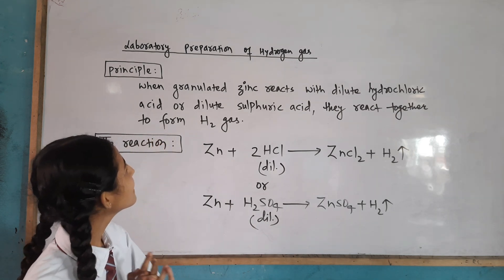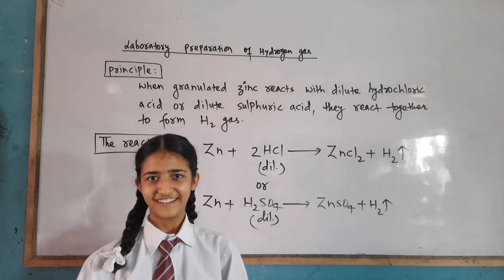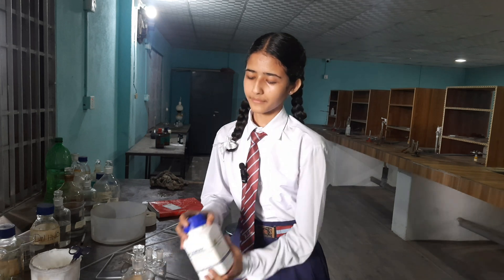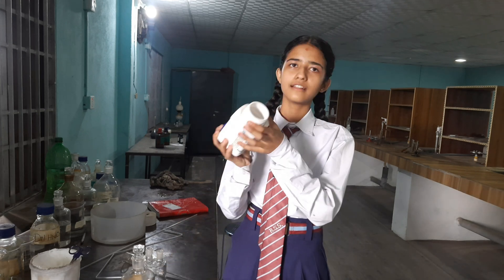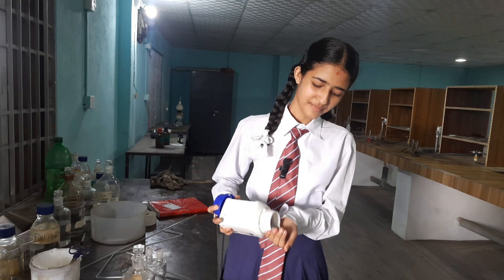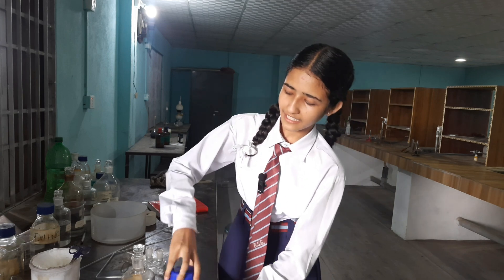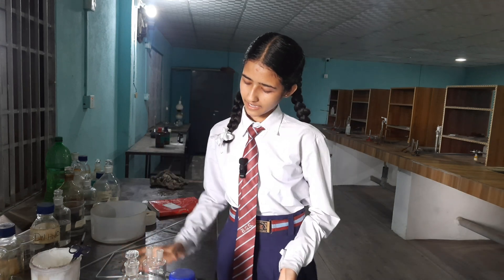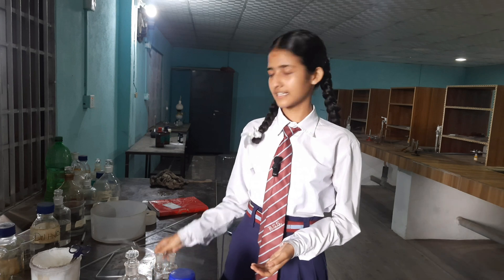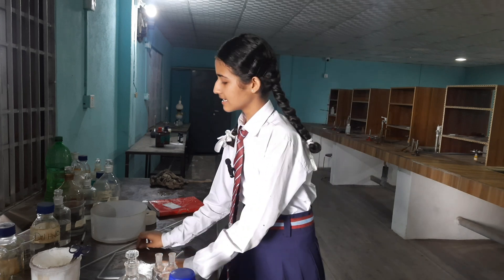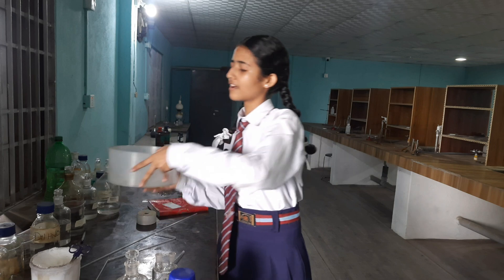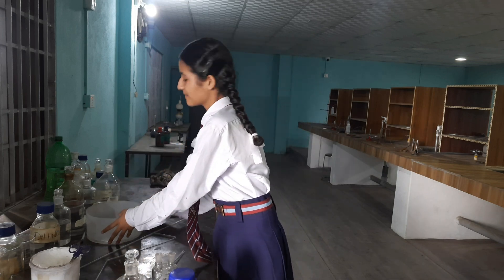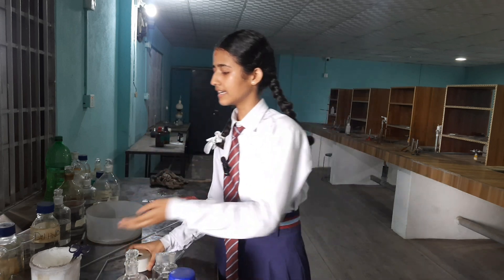In this way we can prepare hydrogen gas in the laboratory. For the laboratory preparation of hydrogen gas we need some chemicals and apparatus. Chemical number one is zinc granules — these are pieces of zinc. The second chemical is H₂SO₄. The apparatus are: this is the Woulfe bottle, this is the thistle funnel, this is the delivery tube, this is the water trough, and these are the gas collection cells. We also need wax to make it airtight.